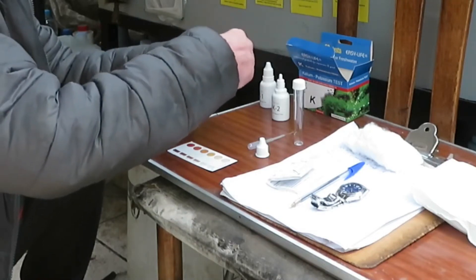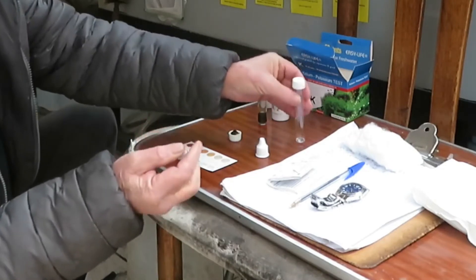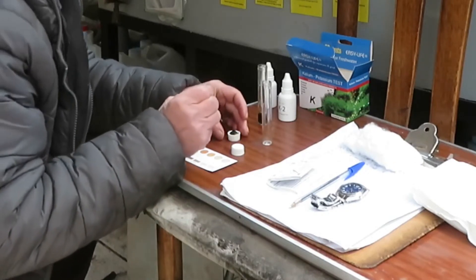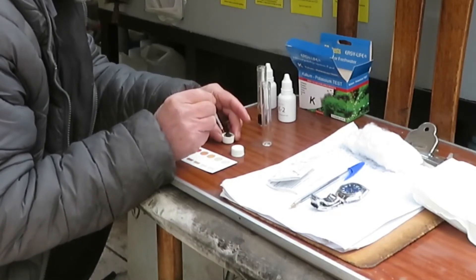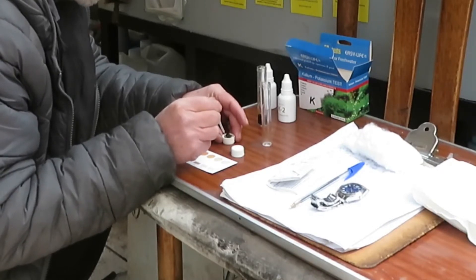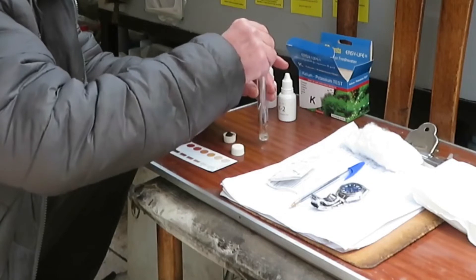We take the cap off. With the pipette, we first take the cap off the other vial to have it ready. We squeeze the pipette between our fingers, place it on the wool, and unsqueeze very slowly so that it absorbs liquid and not air. If we do this too quickly, it will bring up more air than liquid. Then we put the liquid into the other vial.